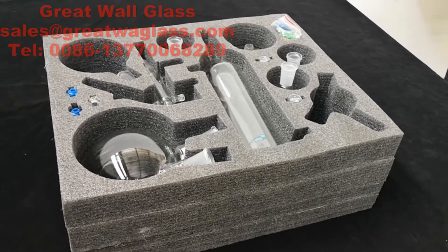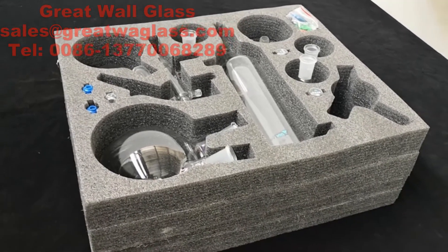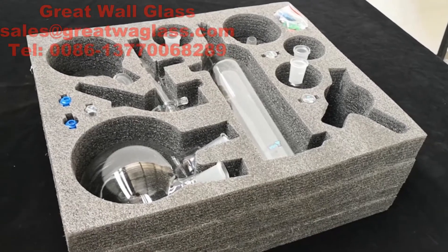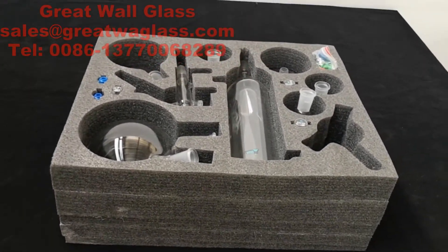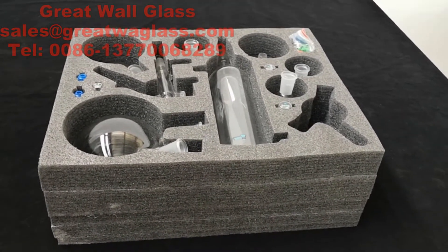This glass short path distillation kit is mainly used for carrying out CBD and THC processes. Here is the two-liter type. I will introduce its glassware. It uses safe foam packing.